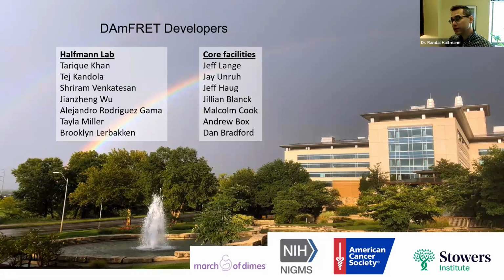And so what we can do is, what is the monomer structure? We don't actually know. We know from other work. Lots of people have simulated this protein and done CD and all this stuff. And the monomer structure is disordered. It's a collapsed, extremely viscous, but extremely disordered species. For a long piece of polyQ, there's no helicity, even though a shorter stretch of polyQ does form a helix. And AlphaFold will tell you with 90+% confidence, or pLDDT, that it is a helix. But for long polyQ, that's not true.